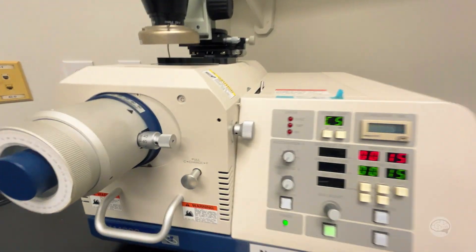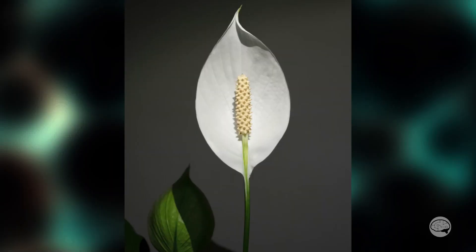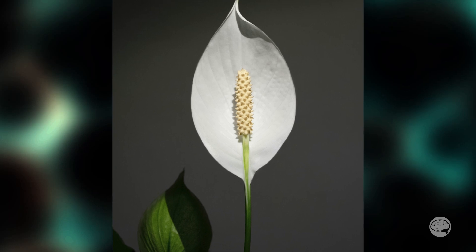Have you ever wondered what was on the inside of a little piece of pollen? Yeah, me either, but I've got this broad ion beam milling system here and I really want to cut something in half with it. So I found some pollen lying around from a peace lily plant and I thought, let's see what happens.